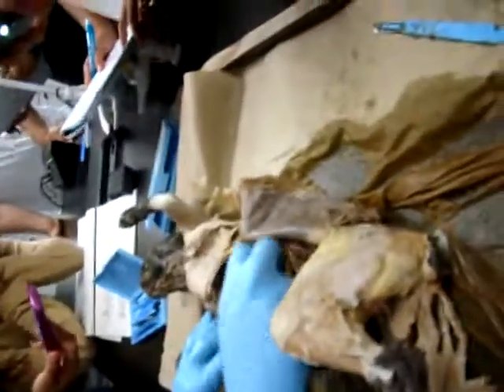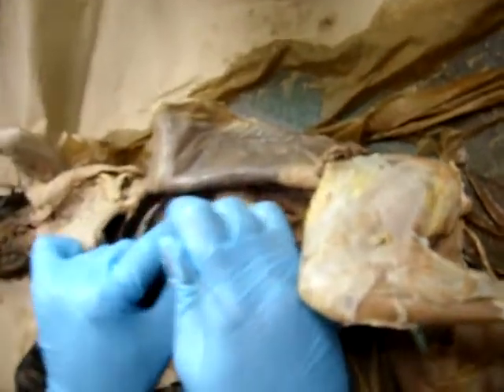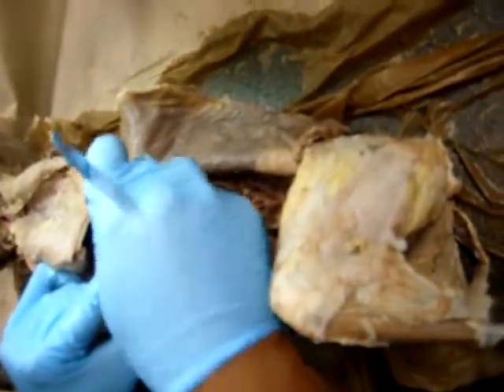Now, the esophagus. Liver, right? Liver here. Stomach. Gallbladder here. This is the stomach right here. It's cut open into the stomach. See what he ate. Sometimes you see worms and everything. Imagine they're alive, that would be funny. No, they wouldn't be alive. So now we can check what the cat ate.